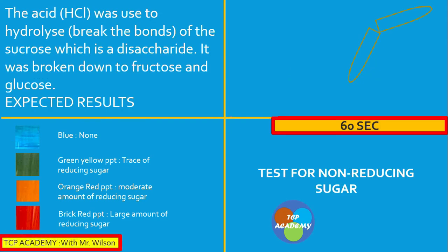Hydrochloric acid will be used in this experiment. Hydrochloric acid is used to break the bonds of the sucrose, which is a disaccharide, breaking it down into glucose and fructose. Here we have added the sucrose solution to the boiling tube and are now adding one centimeter cube of hydrochloric acid to the mixture.